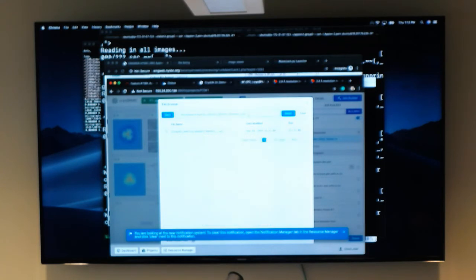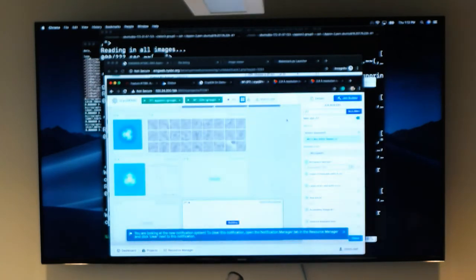These, I think, are the projections. Yeah. So this is from the 3-4 review, 3-4 Nexus. It looks like it, I'm not sure. Probably this is from the 2-4.